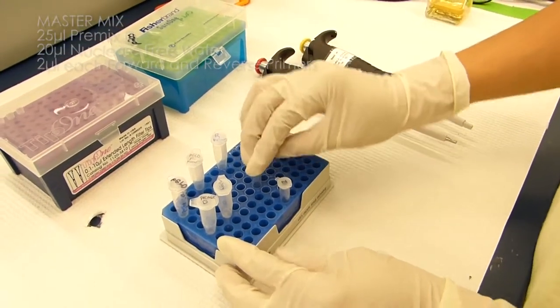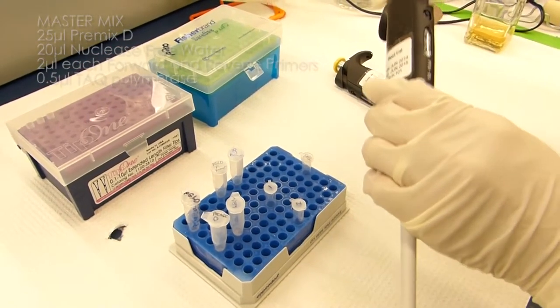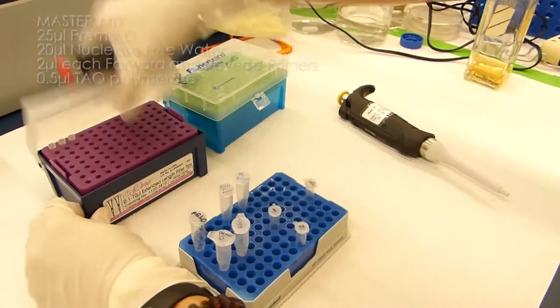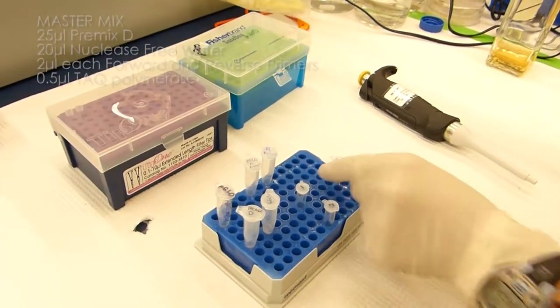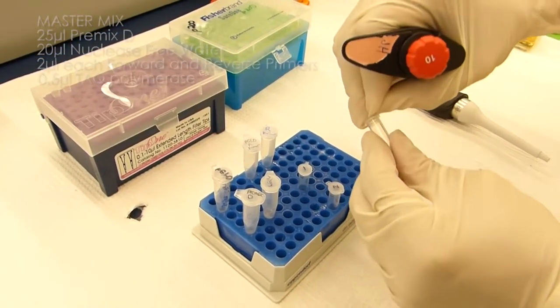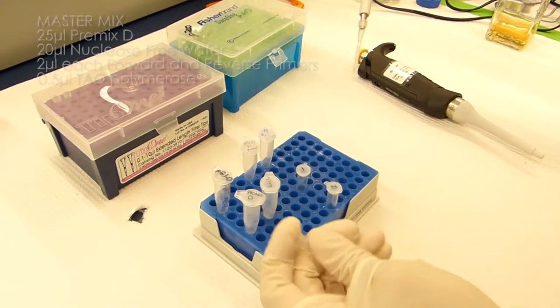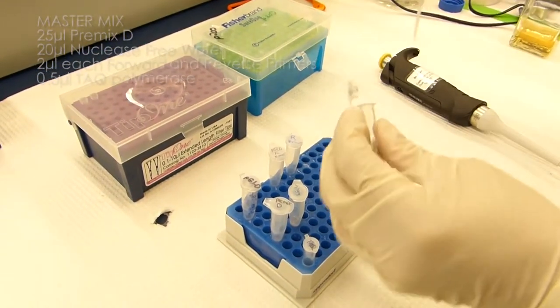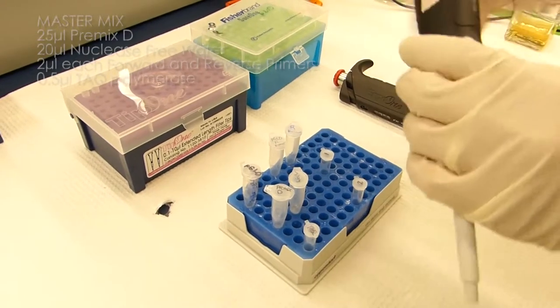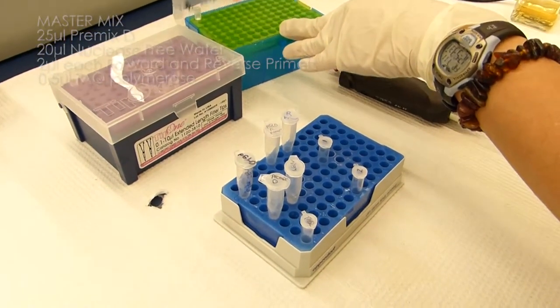So now our master mix contains the Premix D, the water, and the primers. Now we add the Taq polymerase last. In this case, we're adding 0.5 microliters of the Taq polymerase. We want to add the Taq polymerase last because Taq is an enzyme, and we want to make sure that the conditions are buffered and at the proper salinity for the enzyme so that the enzyme doesn't fall apart. Taq polymerase is in a solution of glycerol, which will sink to the bottom of the tube, so when we add it to the solution, before we make our aliquots, we need to mix the master mix gently with the pipette to ensure that the Taq is evenly distributed.